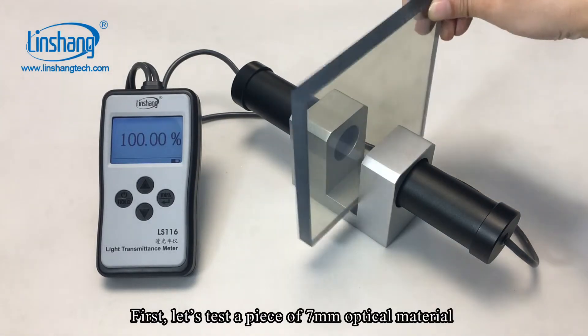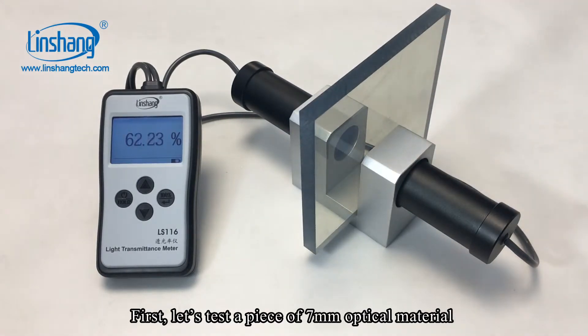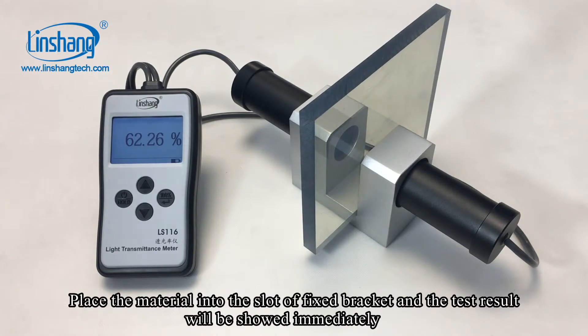First, let's test a piece of 7mm optical material. Place the material into the slot and the result will be shown immediately.